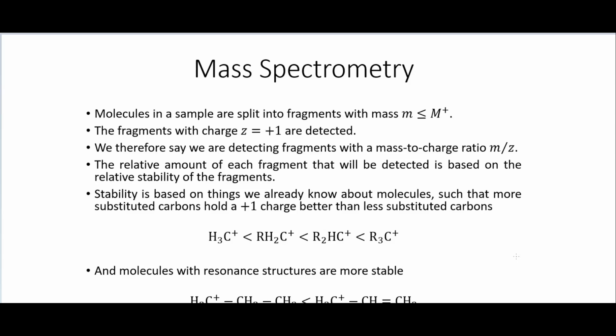In this video, I am going to start discussing how to interpret mass spectra. Of all three of the techniques used in organic chemistry, which are IR, mass spec, and NMR, obviously there are others, but those are kind of three staples, I think mass spec is probably the most difficult to interpret. IR, once you see a few of them, they are pretty easy to interpret.